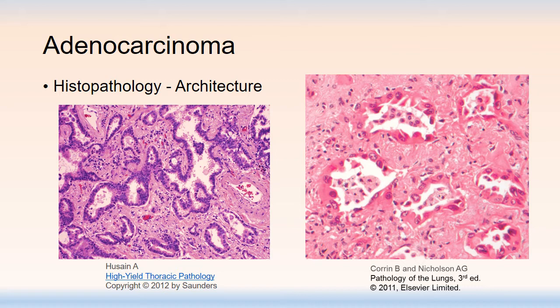The most helpful feature of adenocarcinoma is the architecture of a gland itself. Once you see an architectural pattern showing gland formation you can be more assured that you are likely dealing with an adenocarcinoma. On the left hand side you can see a range of what a glandular profile looks like microscopically — sometimes round, sometimes oval, sometimes tortuous — but they all have in common that the malignant cells are growing around a central lumen. This recapitulates their glandular origin, and glandular architecture is the key to figuring out that a tumor is adenocarcinoma.